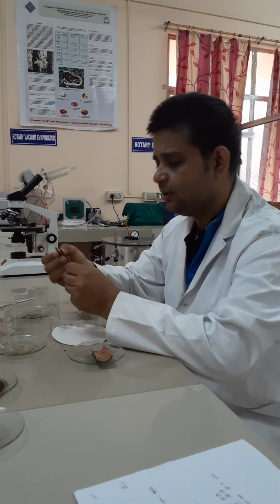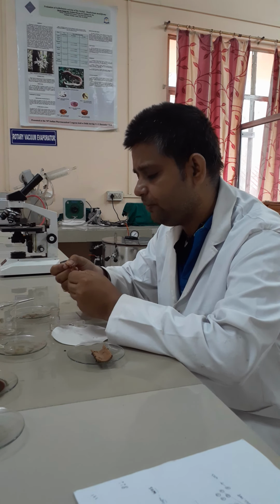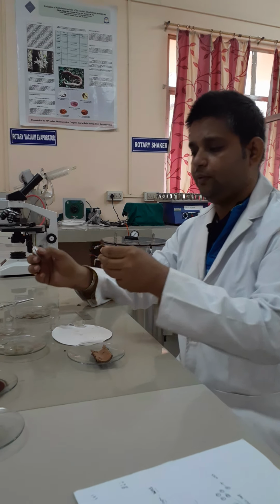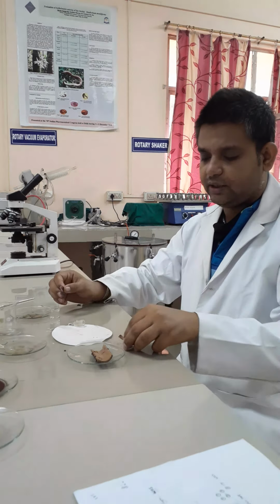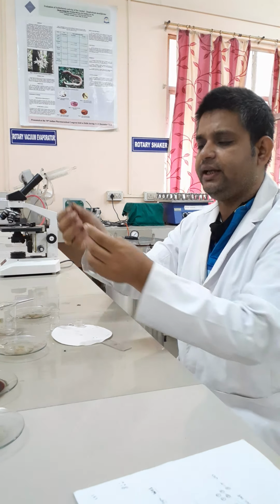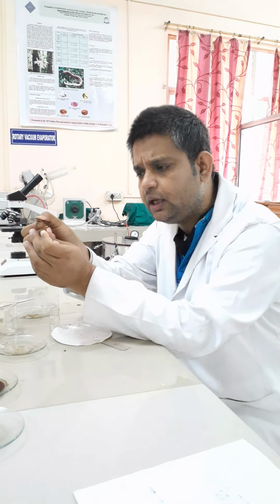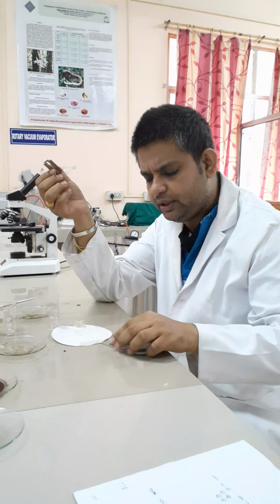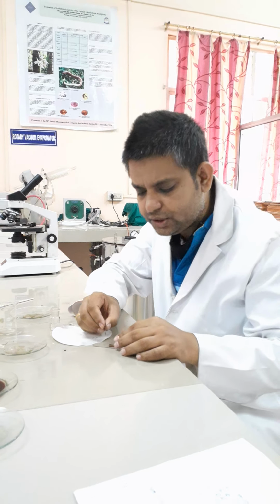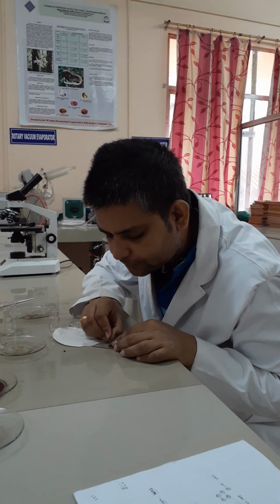Now, first you just remove the topmost part to make the surface leveled. We have leveled the surface. Now watch very carefully how to take the transverse section. You can take as per your convenience. You can take the transverse section in this fashion, or you can hold it here and with the edge of the blade you can take the transverse section.